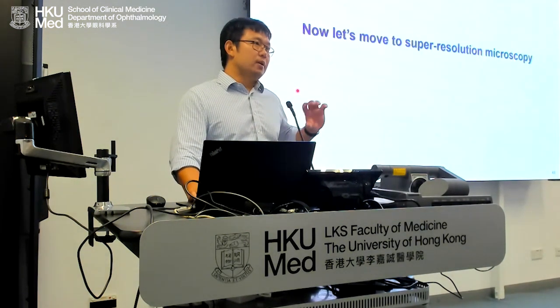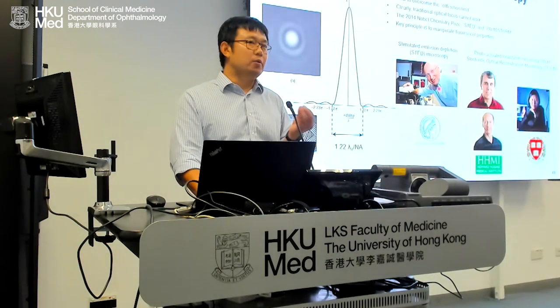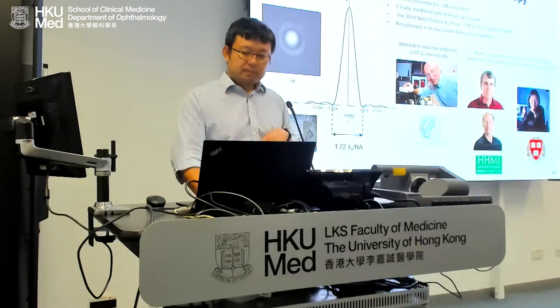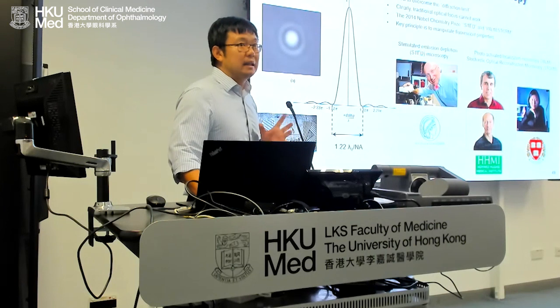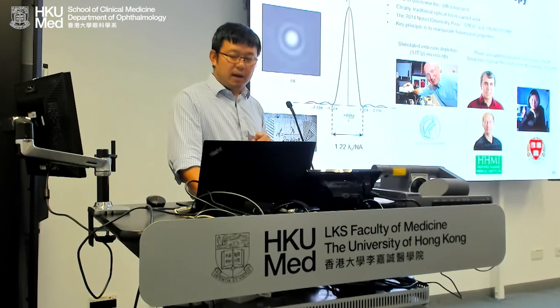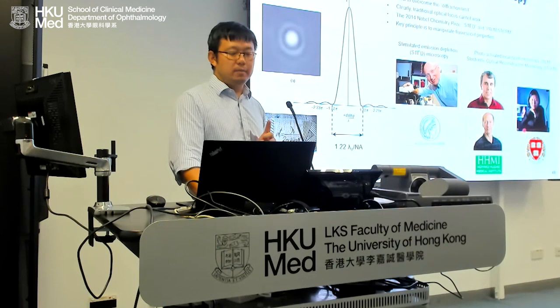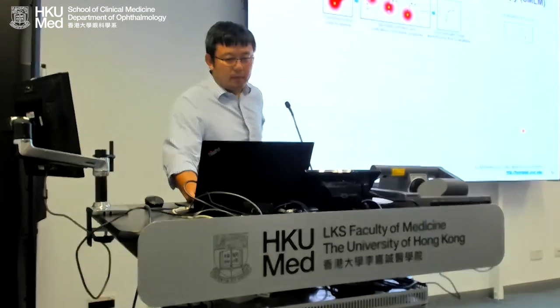So let's move to super resolution quickly, and then I'll show why we like it and where our contribution is. Super resolution was the 2014 Nobel Prize. Eric Betzig from Howard Hughes and Stefan Hell from Max Planck, and there's a third one from Stanford. They shared the Nobel Prize, but behind the scenes, Xiaowei Zhuang from Harvard and Harald Hess from Howard Hughes also contributed significantly to super resolution microscopy. They were not awarded the Nobel Prize. A Nobel Prize can be awarded to up to 3 people. So that's too bad.